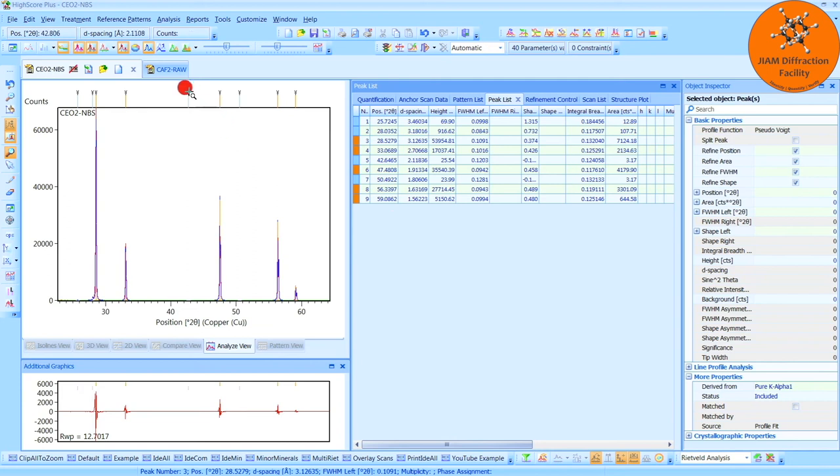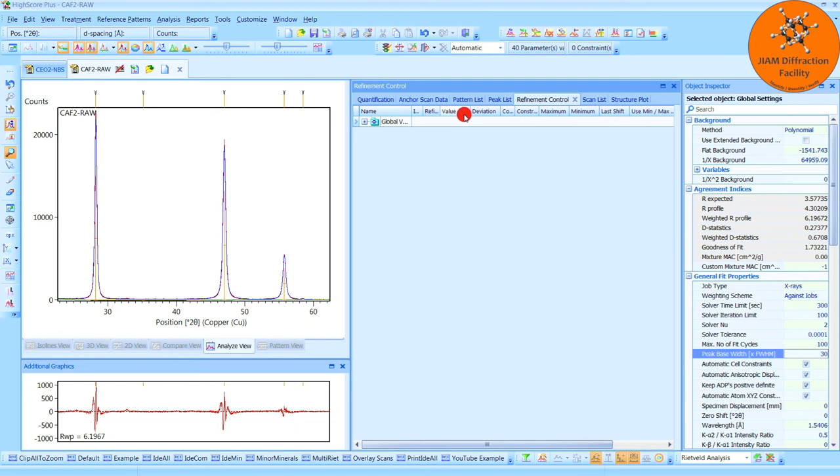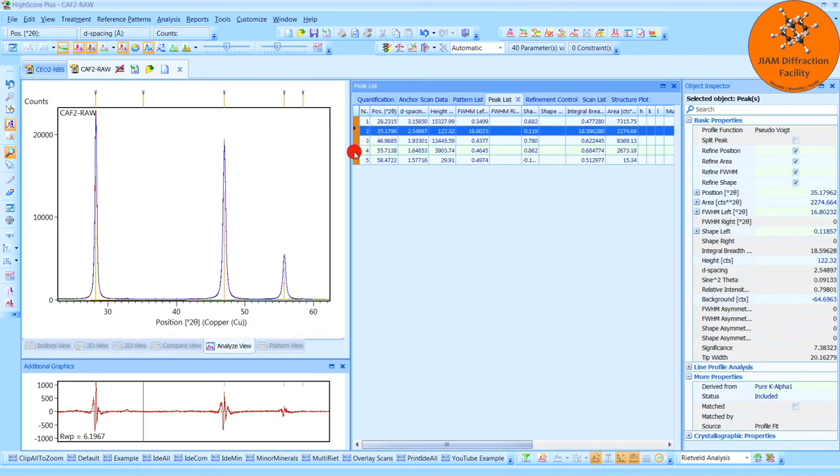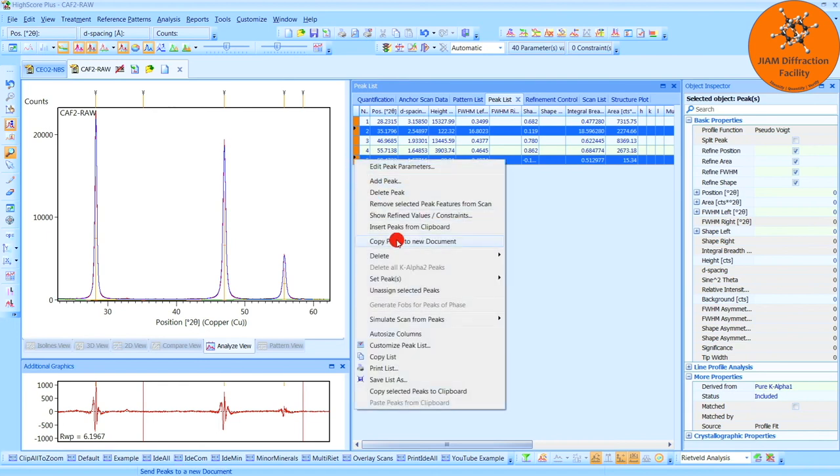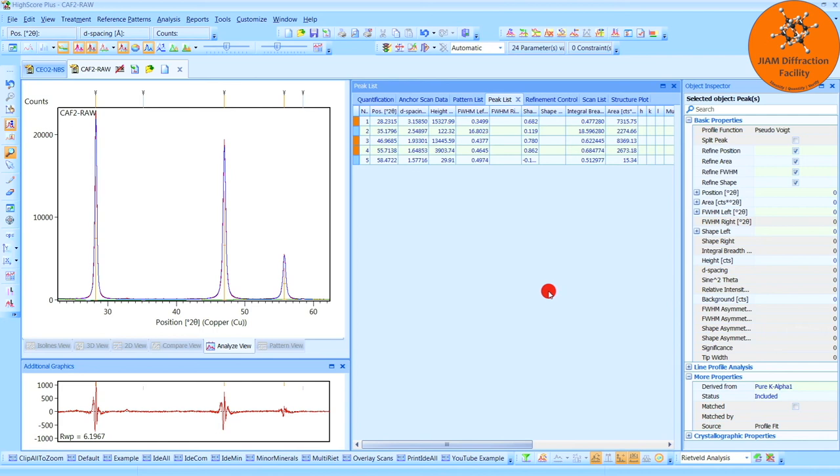Let's go over to our sample of interest, the fluorite pattern, and do the same thing. I will go to Peak List. I see Peaks 2 and 5 have very small heights, so I'm going to right click, Set Peaks as Excluded, and now I will ignore those.